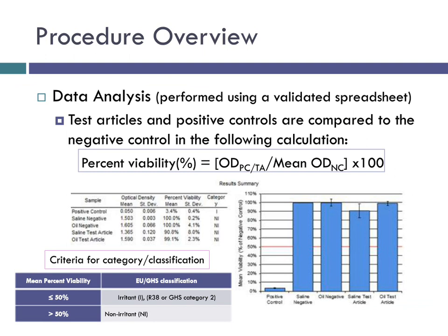We can look at for interleukins that are signals for irritants. In fact, at Nelson Labs, we perform that on all the tests because we want to make sure there's not a device that is still viable but has issued interleukins in the cells. So interleukins is just a way for us to have an additional screen for potential irritants. So that test is performed here at Nelson Labs on every single device, fail or not. We add that test to the test procedure. So that's the in vitro irritation.